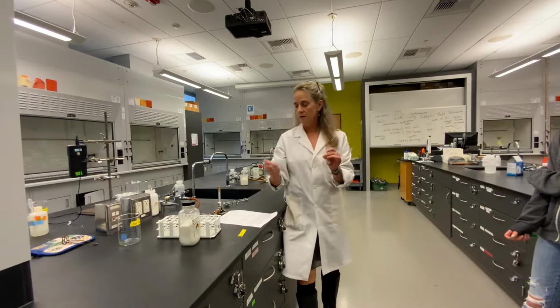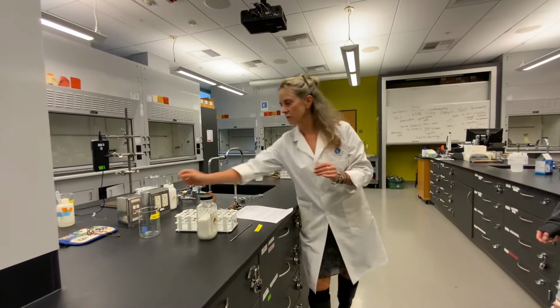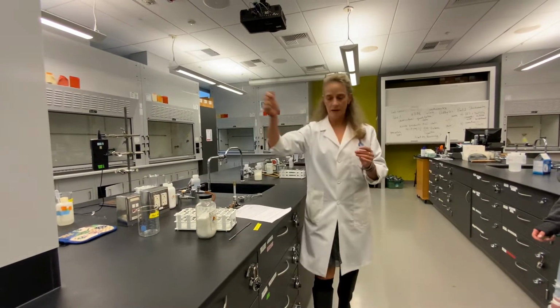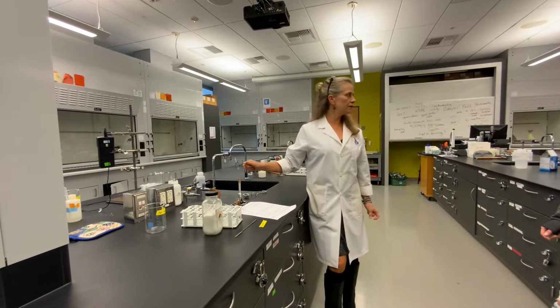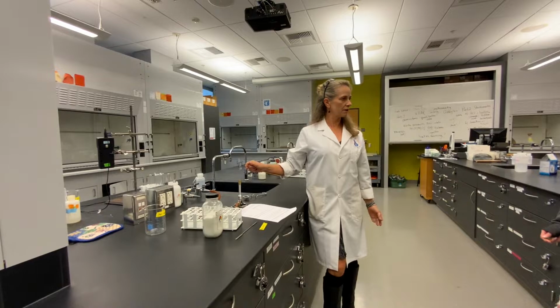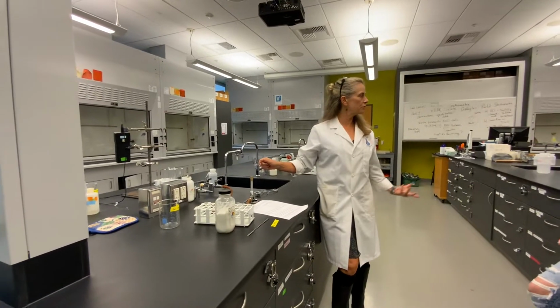That's okay. And again, you're going to use a test tube holder, right, to hold the test tube, and then it's going to go in the flame. If you burn this too much, it'll smell like burnt marshmallows in here. Okay, so you're just looking for a color change.